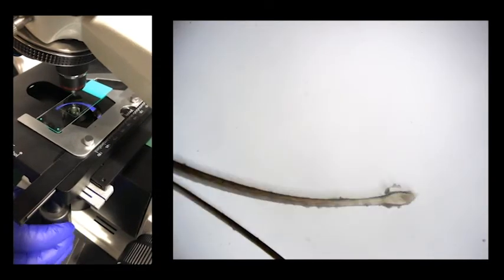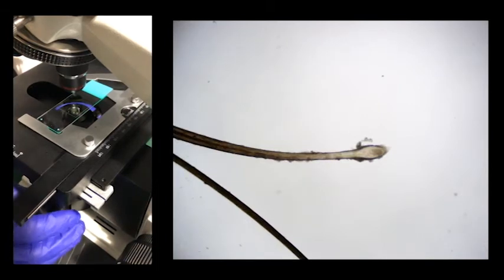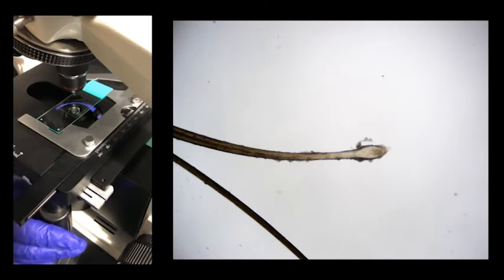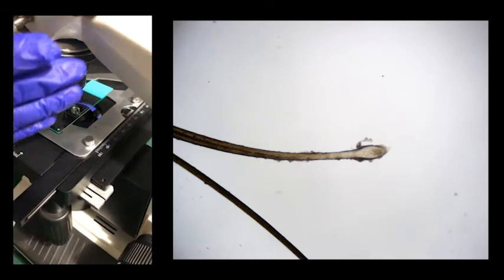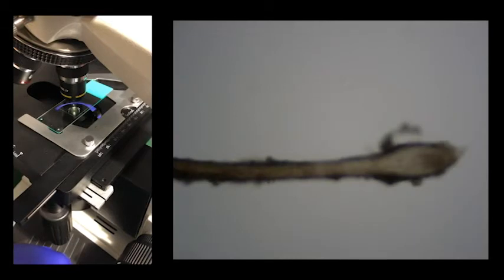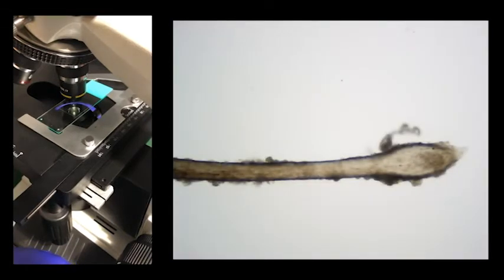Now that's a really cool piece right there—that looks like a root, in which case this is a hair fiber of some sort. So we'll get a little bit of a closer look so that we can see what type of hair fiber it might be. To do that, you just turn the nose of your microscope to the next magnification and use the small knob again to sharpen that magnification.